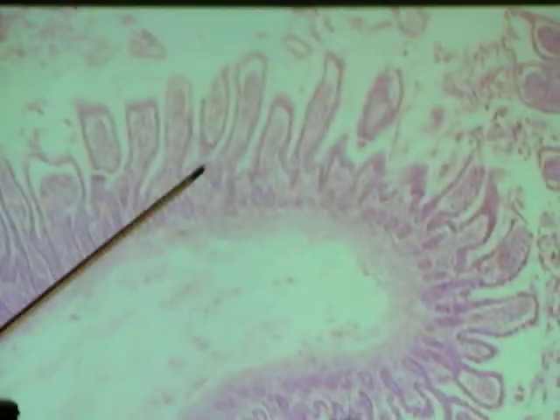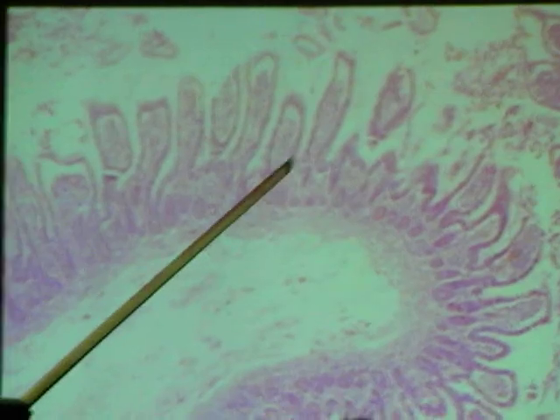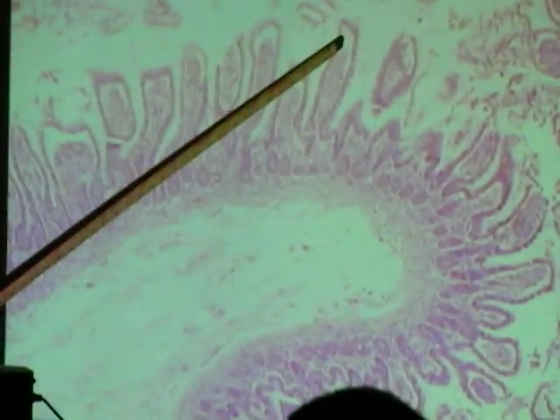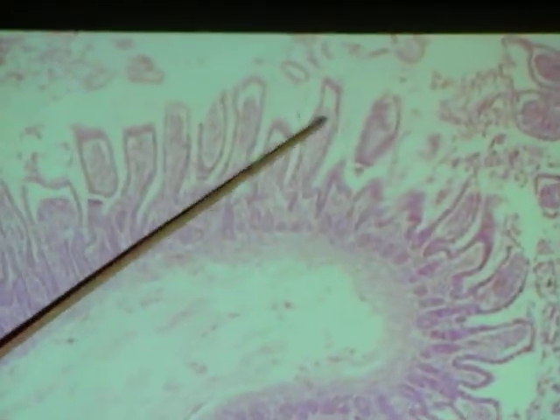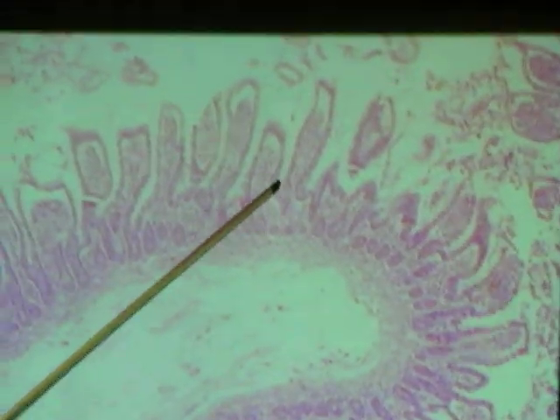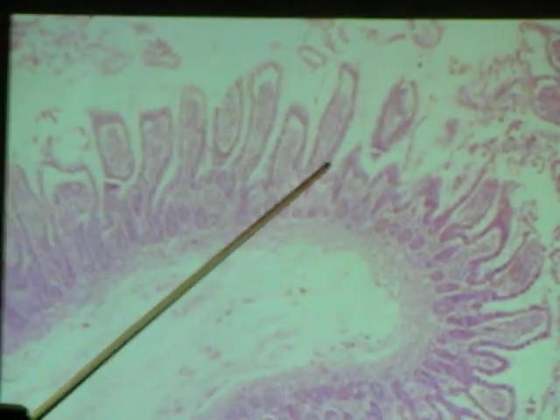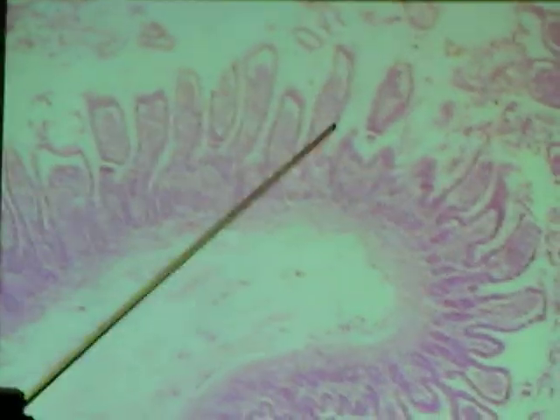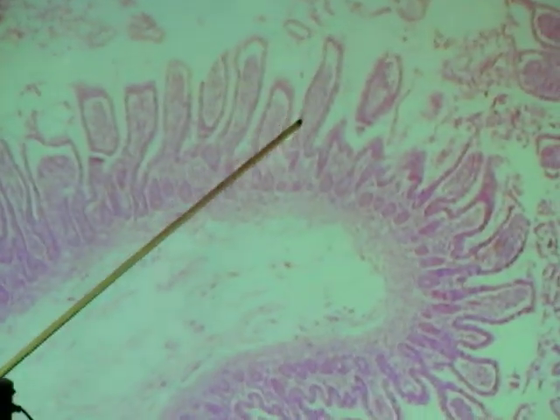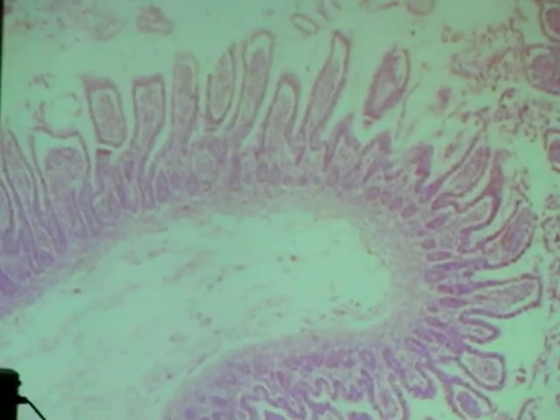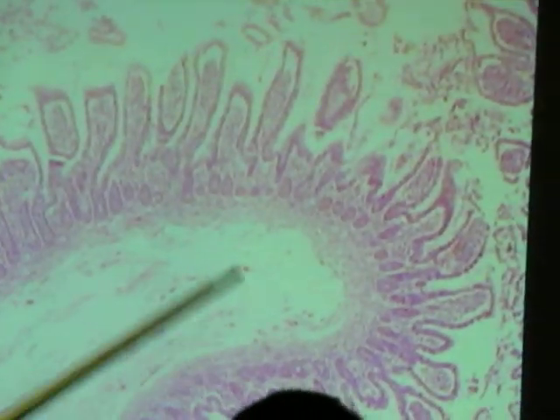Again, the villi would be the entire rounded projection in the pointer. Otherwise, it would be pointing to the epithelium that goes around this, which would be the typical columnar with some goblet cells, and I'll show you those in the higher magnification.